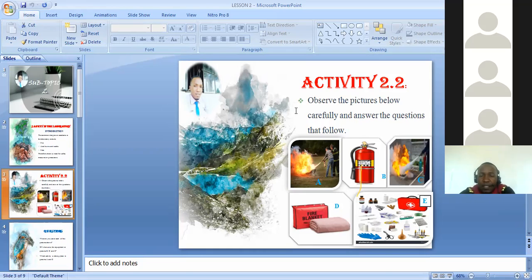So the fire extinguisher, everyone among us should know how to use it, because we see it in very many places. At all petrol stations, there must be fire extinguishers. In all schools, including ours, we must have fire extinguishers at all possible corners, all corners which are easily accessed. So among others, this is going to be a common tool because we expect fire at any one time.